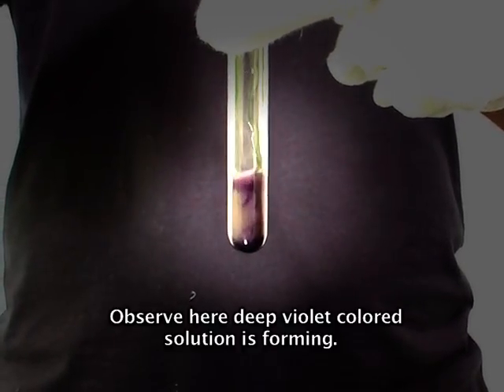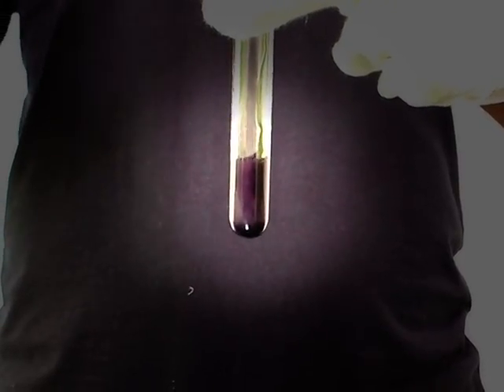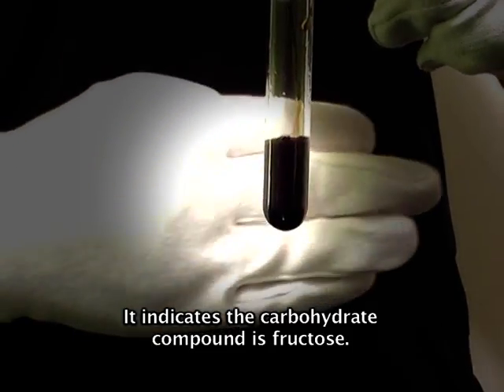Observe here: a deep violet colored solution is forming. This indicates the carbohydrate compound is fructose.